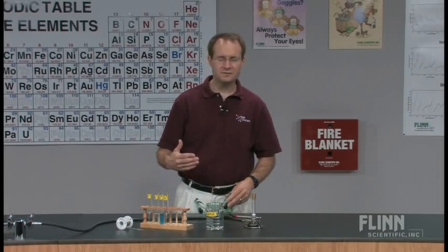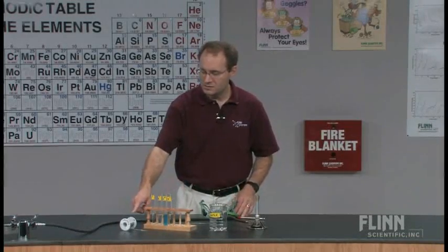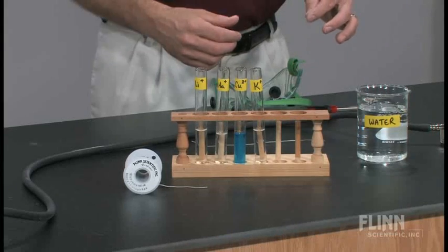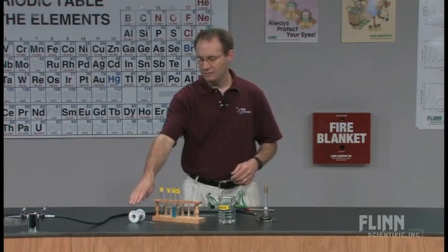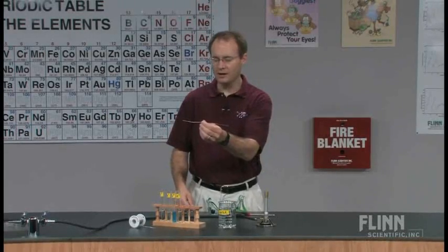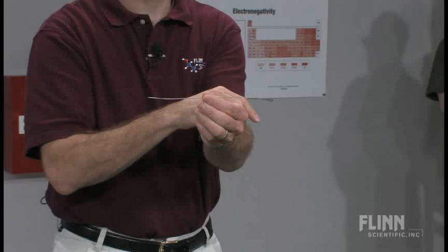Many teachers do flame test experiments in a variety of ways. The way I like to do the experiment involves the use of nichrome wire. What I like about nichrome wire is that it is not a very good heat conductor. In advance of the students coming in, I take the spool of nichrome wire, cut a length about this long, then take a pair of pliers and fold a little loop on one end.